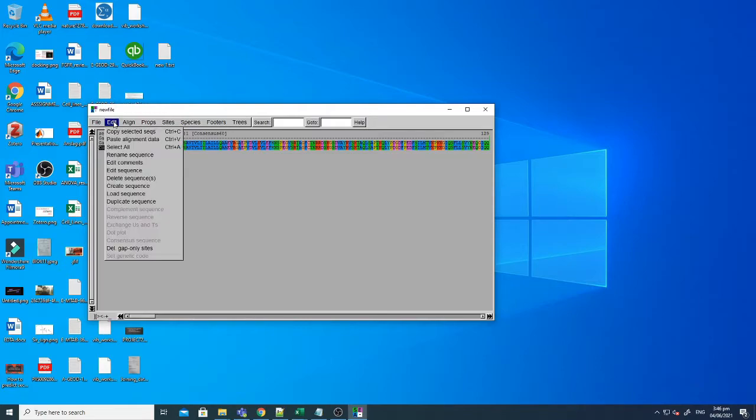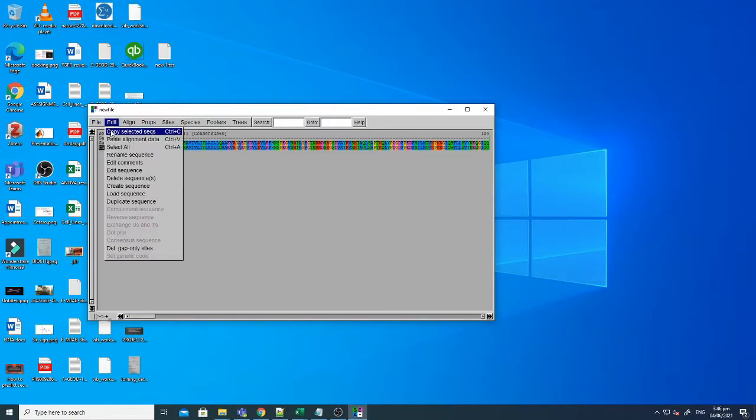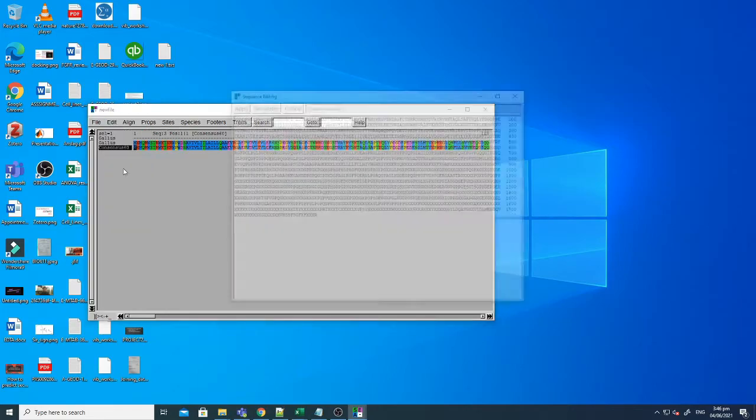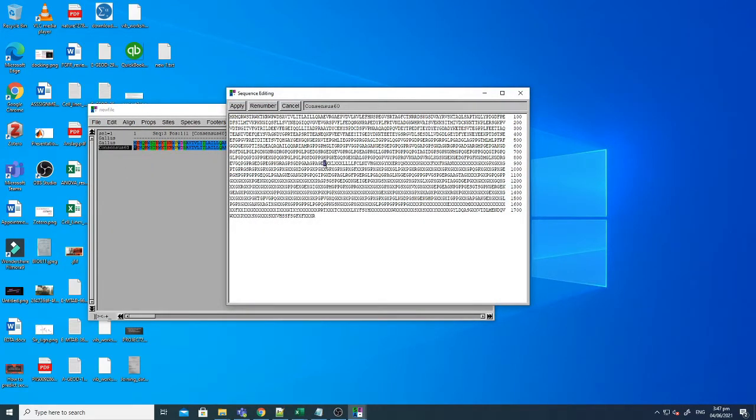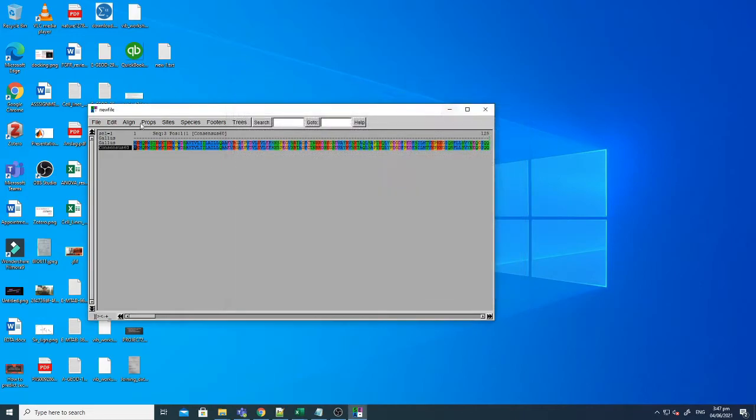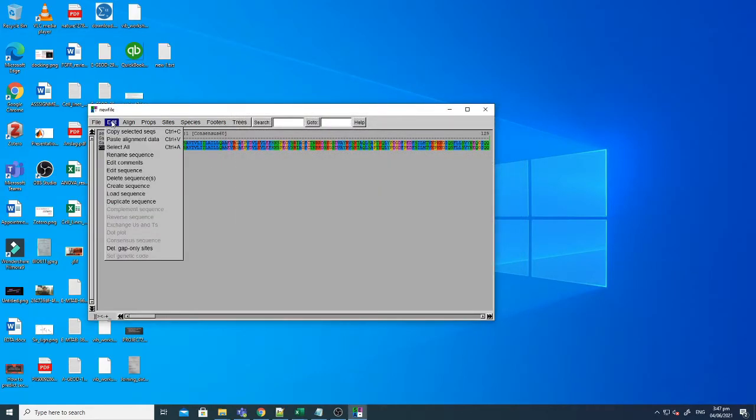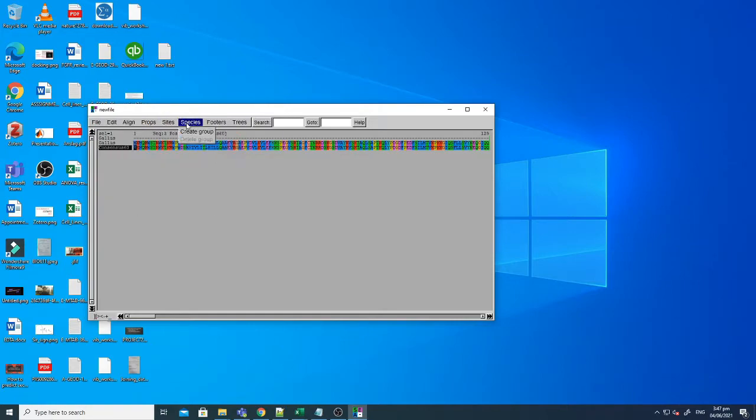You can also get the alignment name, for instance you just click it, edit, and after edit you can say that edited sequence, that edited the comments. You can do all these things. First of all you just click that your sequence and you want to use these exact sequences and you want to change it to some other sequence, you can do it here. And so on and so forth. Other things are also available here, you can also build.